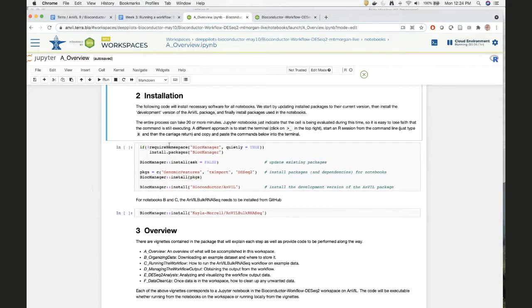And we could go through it. The first thing that we need to do, and this is also a time-limiting step, it'll be amazing if we actually end up getting through just the setup step of this. We need to install a bunch of packages on our runtime. I'm really hoping that in the next iteration of the AnVIL, this step will be orders of magnitude faster. But actually, it takes quite a while.